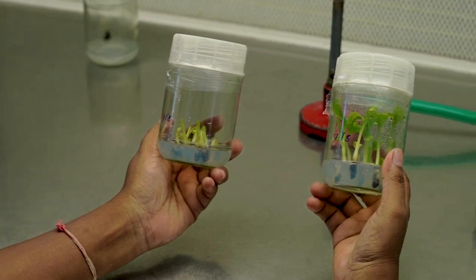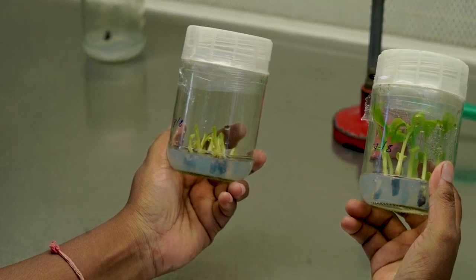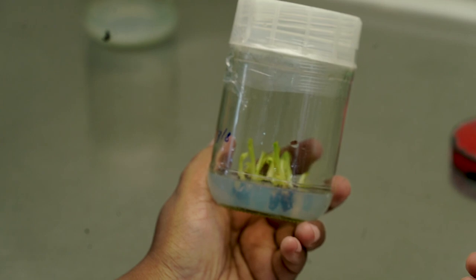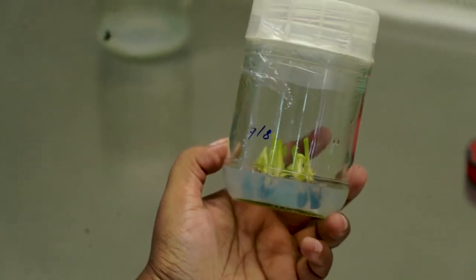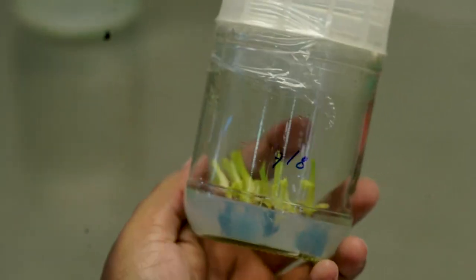So now, as you can see here, there are 2 glass jars. On your left hand side, you can see that the culture jars contain the shoots which are smaller in size. So this is a multiplication stage.